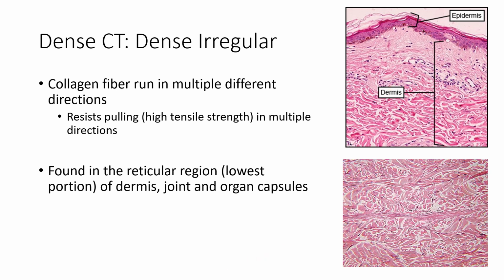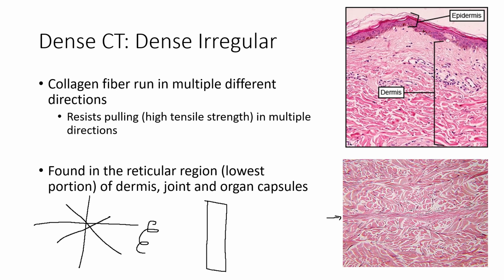But one of the things we're looking at is pretty much what's going on is we have fibers that are sort of running horizontally, they can run vertically, they can run obliquely, and then they can also come out at you, okay? So when we see these, right, so here's one right here. It's been a longitudinal section. So here's a fiber, and we cut it down this way. So it created two really long sections. Sometimes if we have a fiber coming out at us like this, and we chop it like a carrot, we'll end up with these sort of smaller pieces here.